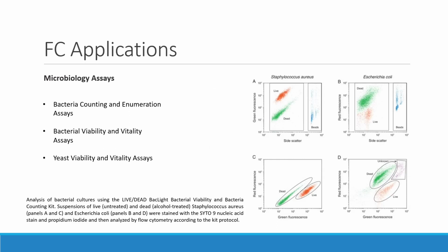In microbiology, flow cytometry permits the reliable and rapid detection of single or multiple microbes and can provide information about their distribution within cell populations. Flow cytometry may also lead to a faster means of viability counting of microorganisms, while at the same time enabling a better understanding of all bacterial cells within a given population. Flow cytometry is used, for example, in environmental biotechnology, microbial community fingerprinting, clinical microbiology, and water analysis.